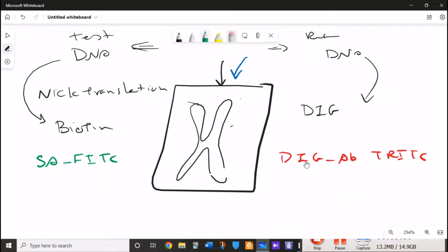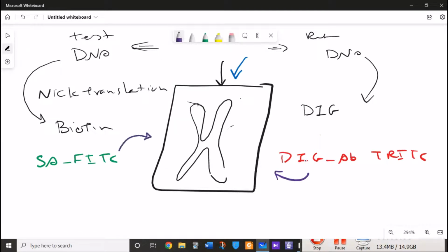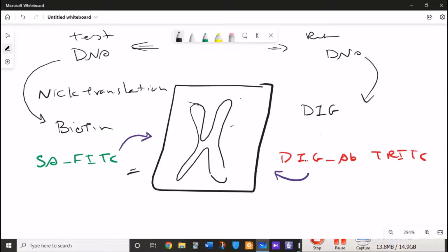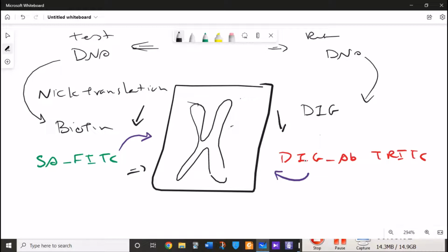In this step, we add both of the DNA samples to the spreads. When we add the samples to the spread, fragments of DNA in both samples compete to attach to the spreads, or single-stranded chromosomes that are fixed on a slide.